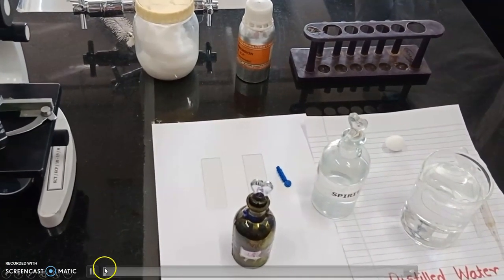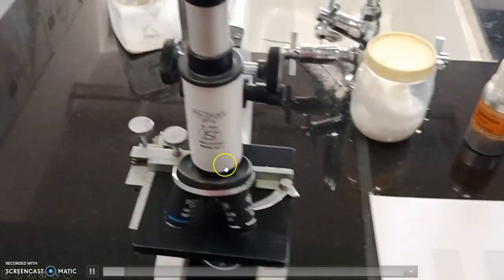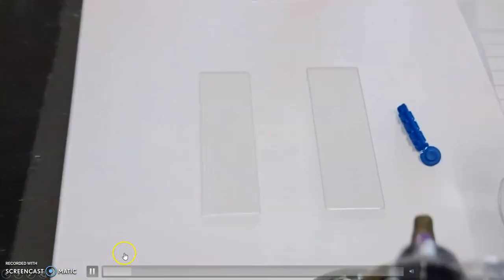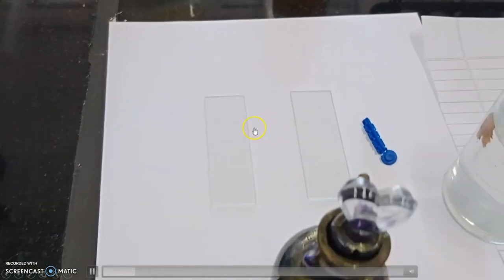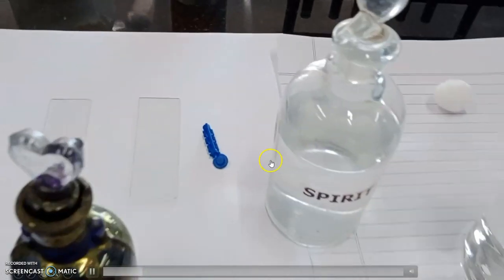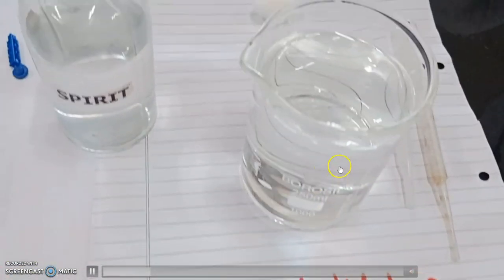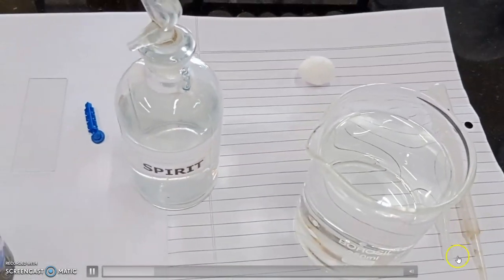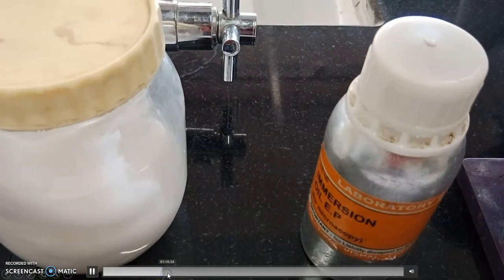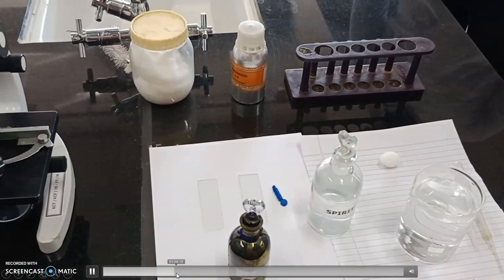Now here is the video demonstration. We take the compound microscope along with glass slides and a light source. We arrange the glass slides, Leishman stain, pricking needle, distilled water, cotton swab, dropper, and cedar wood oil immersion oil. With the help of all these, we will find out the differential count.